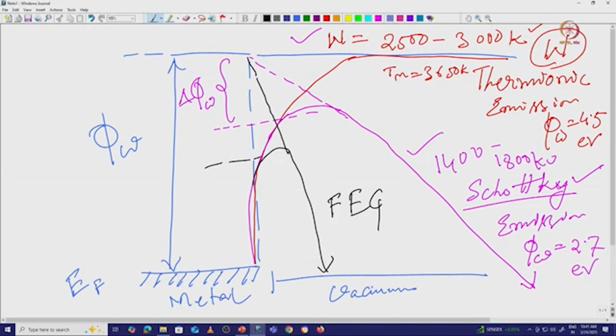What we discussed last class is that a coherent electron beam is very important because the electrons are all in the same phase, same amplitude and same path. This coherent electron beam gives us better contrast and better images, and we can restore the high frequency signal from it.